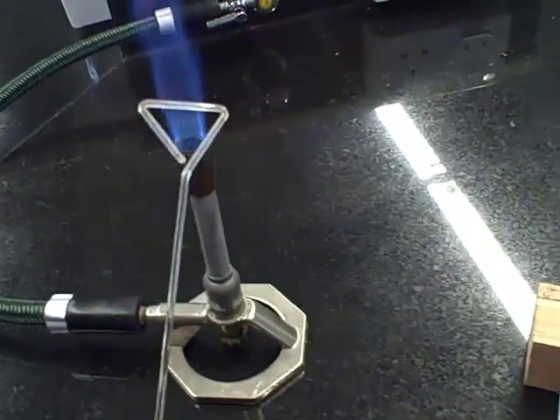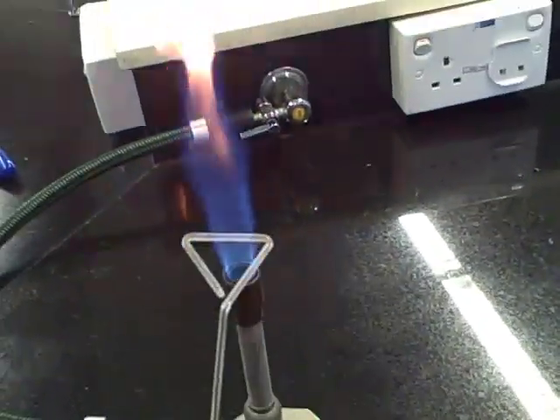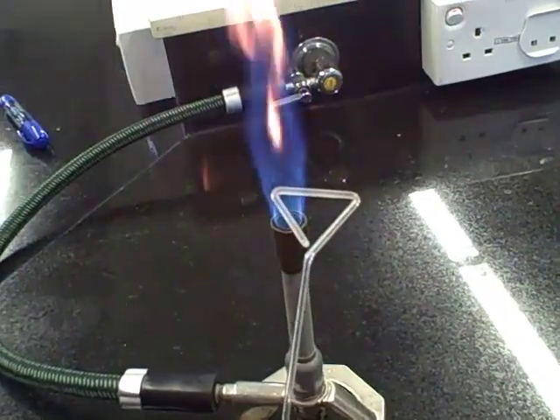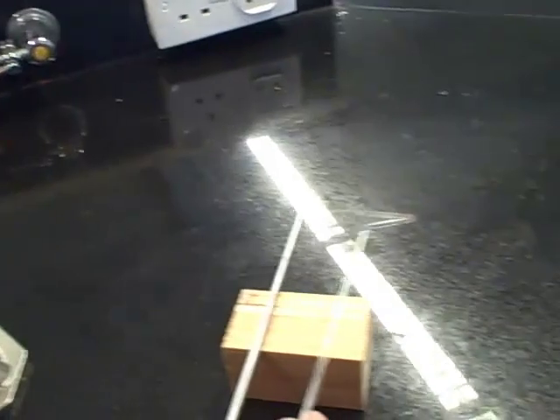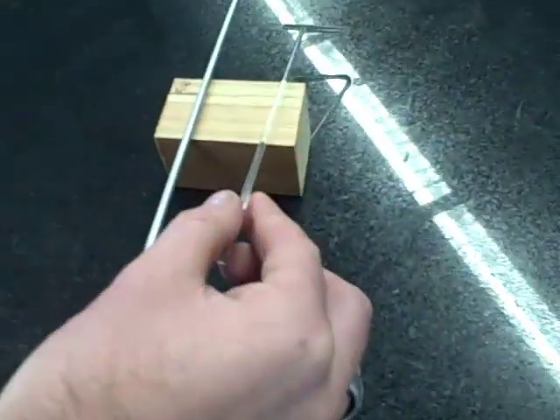Same with the glass rod — you won't see this go red unless you melt it, so just run it through the flame a few times. That will now be sterile. Don't blow on it, don't touch it, leave it sitting down.